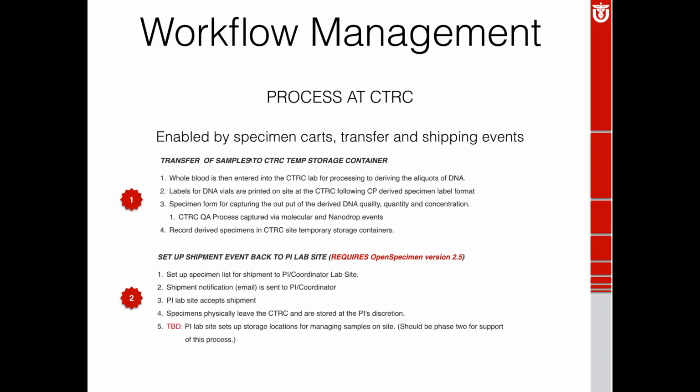We're working on a method to actually either slice up the gel image or upload the whole gel to the, excuse me, the sample. So it's essentially just a link for each sample that shows where that was run through a gel. So once that's all done, and whether or not the samples are of high quality or low quality, they'll record all of that, set them all up for a shipment event.